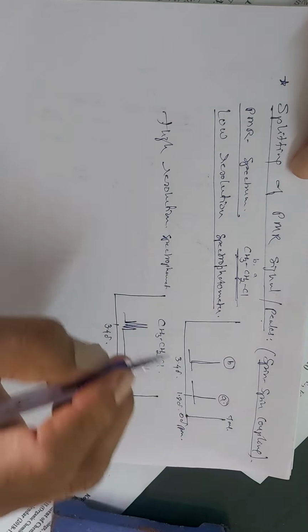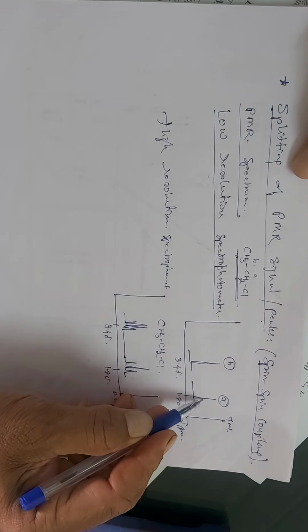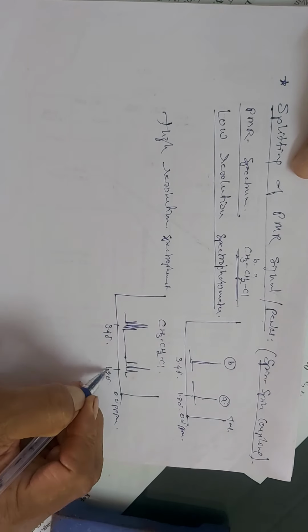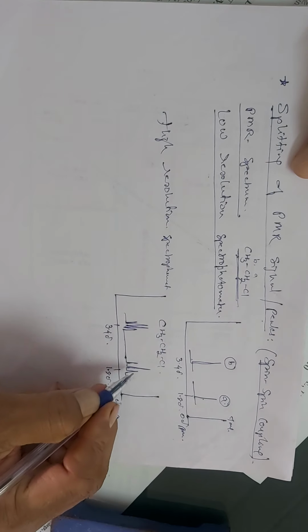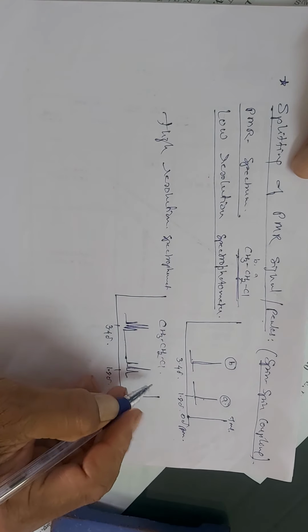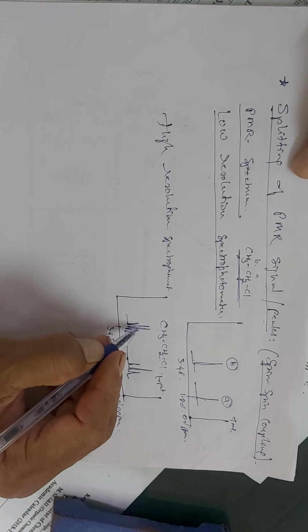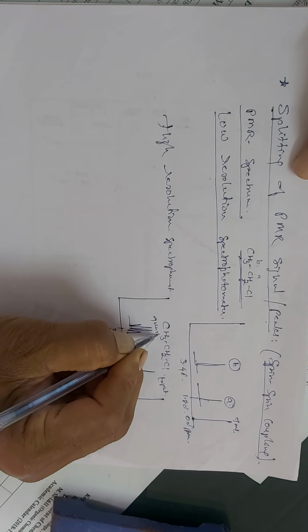One spectrum gives two lines, one signal at A and one at B. But with the high resolution spectrophotometer, the chemical shift values are the same, they do not change, but the one line has been split into three, which is termed a triplet, and one line of B has been split into four, called a quartet.